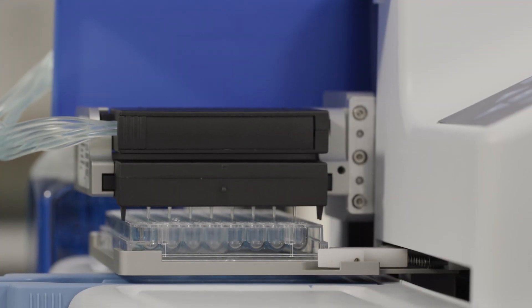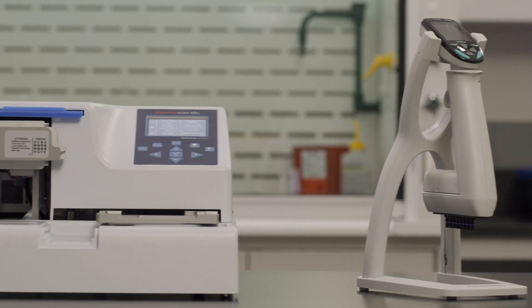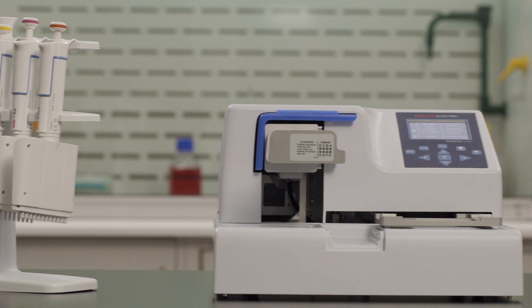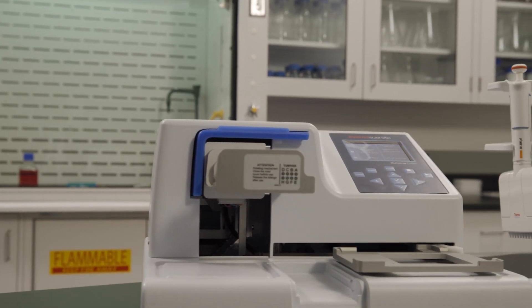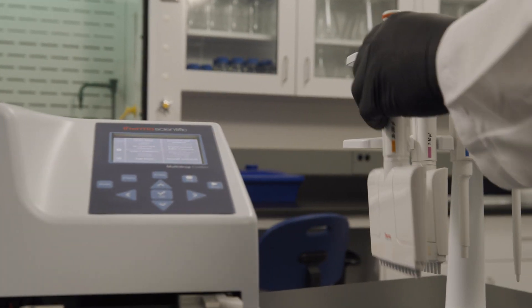Many users are surprised at just how fast the Multidrop Combi Plus is when they first see it in action. Let's compare how quickly we can fill five plates with a common reagent, dispensing 200 microliters into each well. To keep things fair, we will have the Multidrop Combi Plus users start without the cassette installed or their settings programmed.